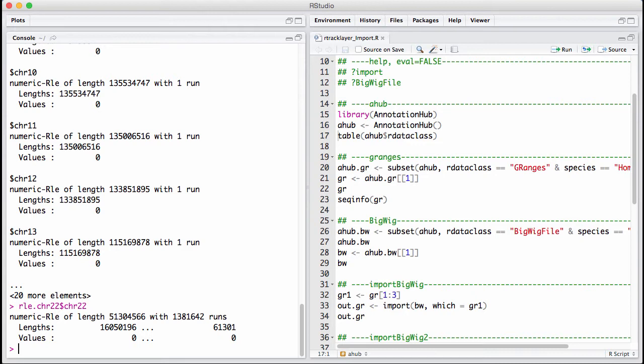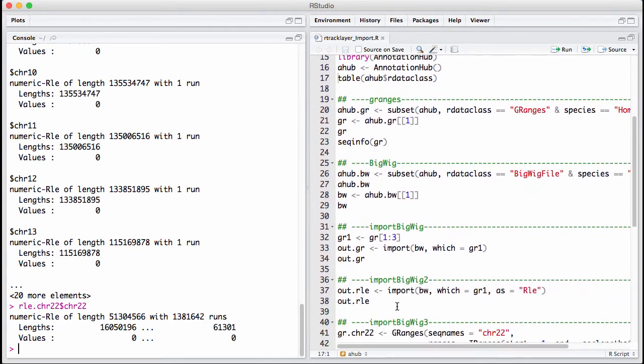You can see that there's again 1.4 million runs. So it's not really clear that the run-length encoding is any more efficient than the GRanges we had to begin with. This is the way you read in parts of a BigWig file.